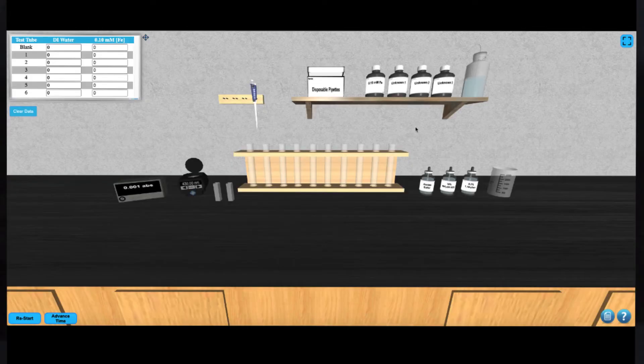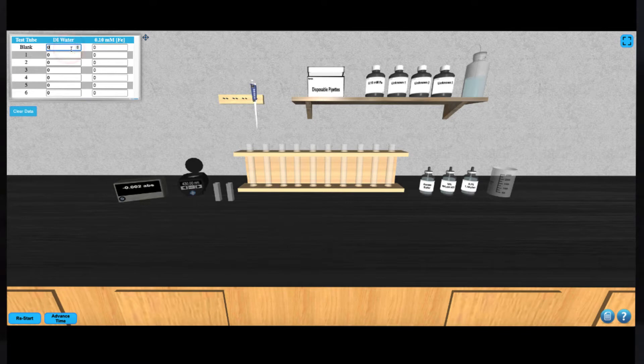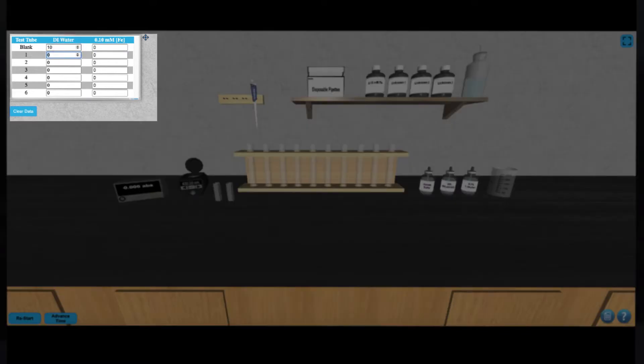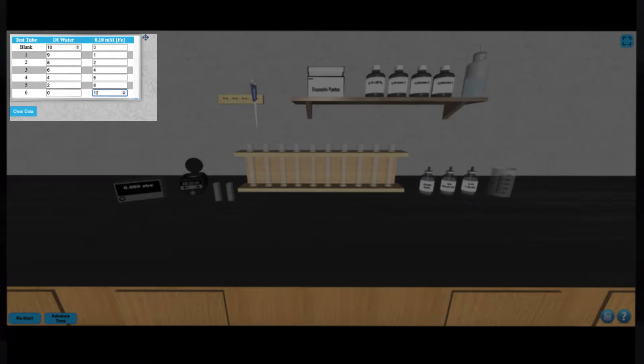To begin, you must prepare all of the required solutions for your analysis. The table on the top left of your screen can be used to keep track of the various volumes of solution components required to make up your blank and the six standard solutions.